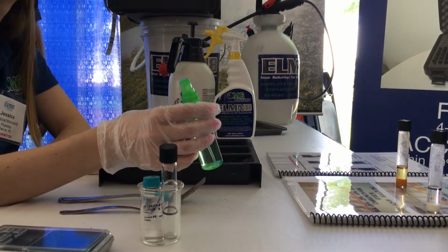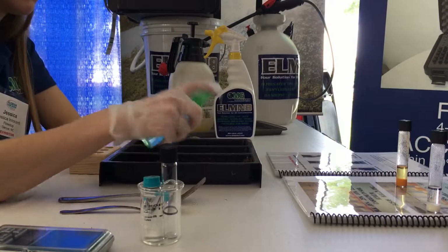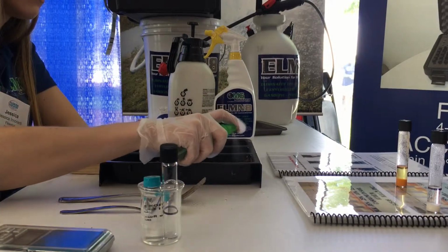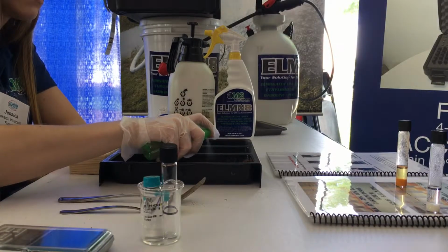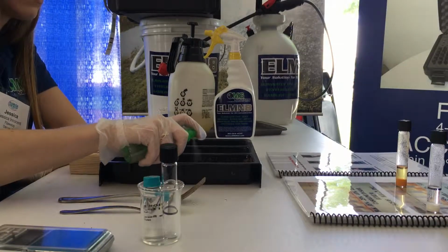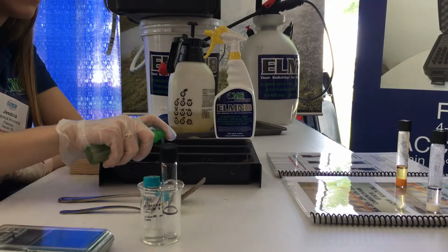And so there's a good semi-quantitative, estimated number for where you're at. You know it's between 25,000 and 50,000. That's what this would tell you. But now we can quantify that number by using a mobile app to make the concentration calculation for us.